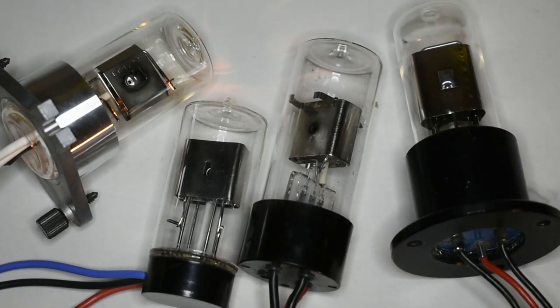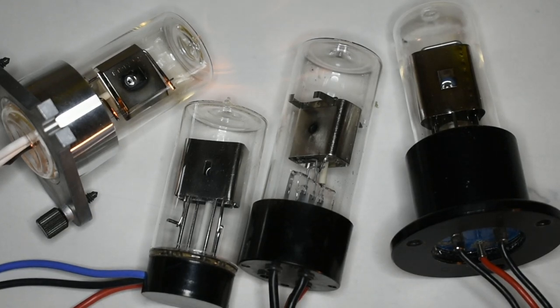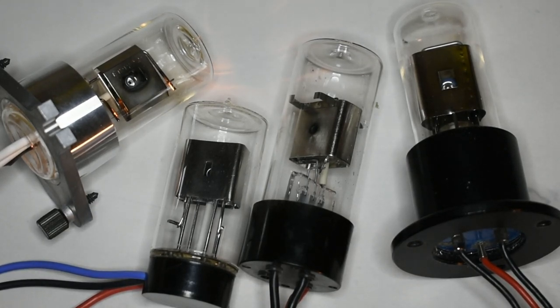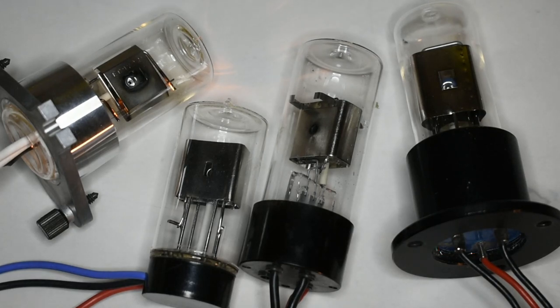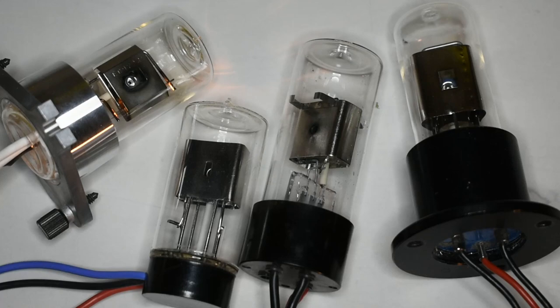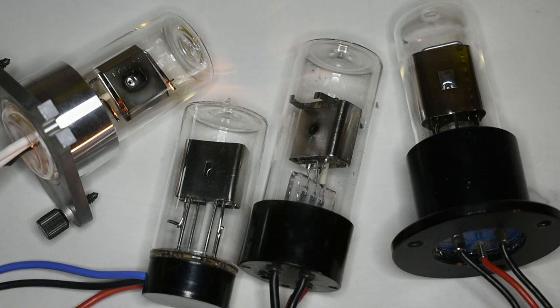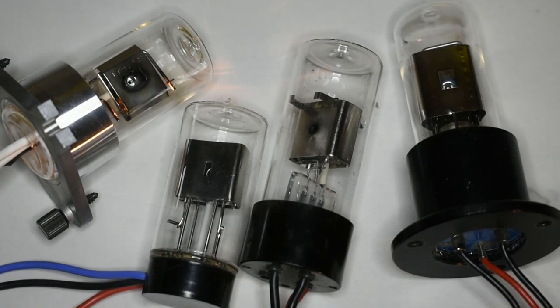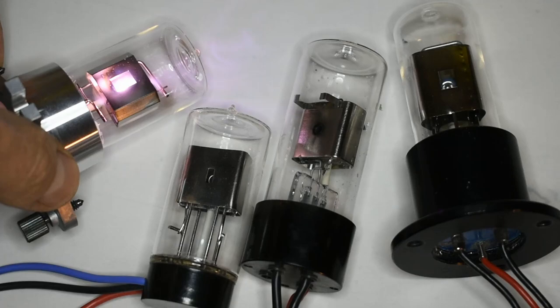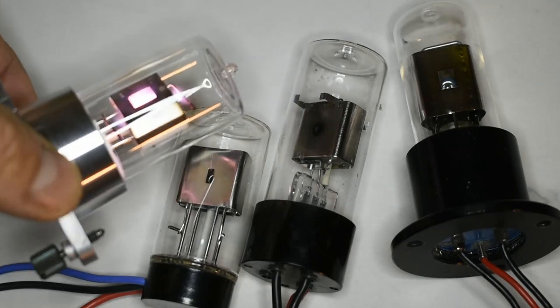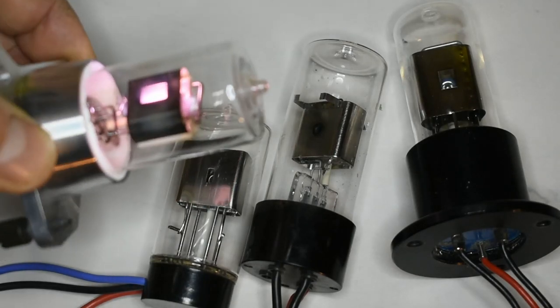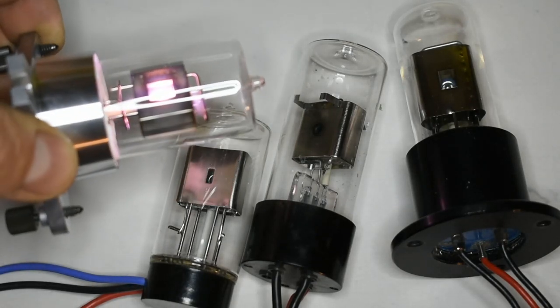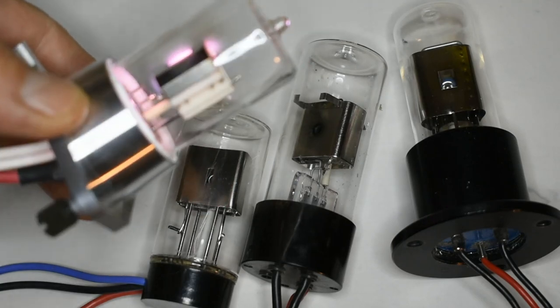These are deuterium lamps used in spectroscopy. They're quite unusual because deuterium is an isotope of hydrogen, which is unusual in its own right. The interesting thing is the spectral line due to broadband molecular emissions for deuterium gives a very long continuous spectrum for the ultraviolet region. It's the continuous quality of the spectrum that makes these so interesting as a light source.